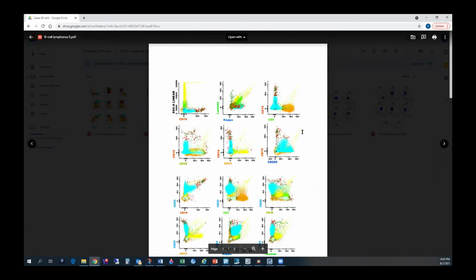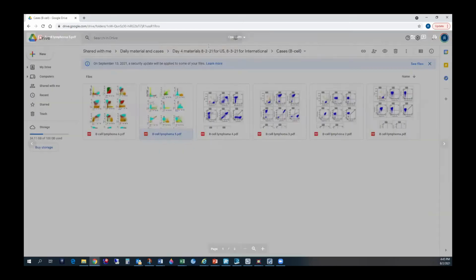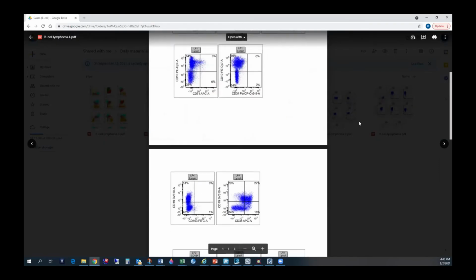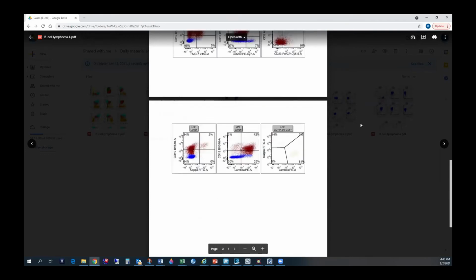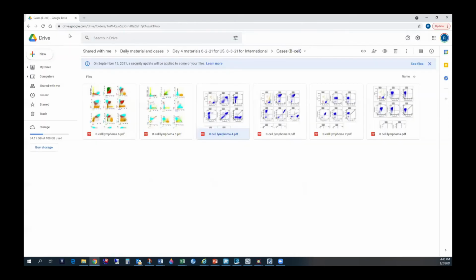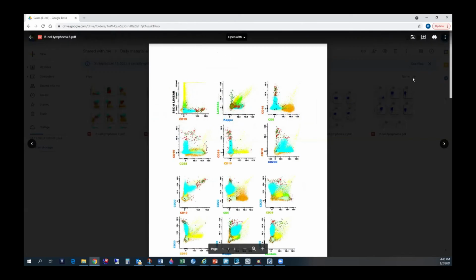Okay, so who's gonna do this one? Oh, are we done with the discussion on the other one? Any questions? Sorry, I assumed there would be no questions. Any questions or discussions, comments? Okay, let's do this. Who's gonna do this one?